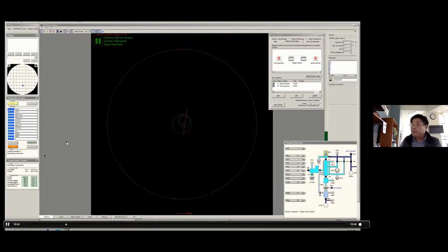We have a follow-up question to that. Can it be realized in serial EM built-in functions without the FastTomo script?